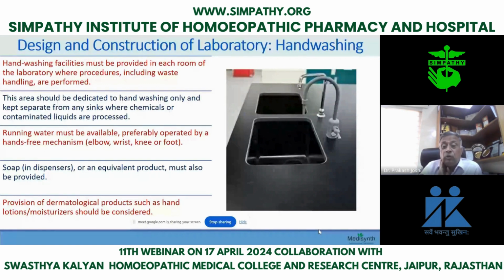Then, if you want to mix that for preparation of mother tinctures, every mother tincture is not 98, 97%. There are mother tinctures which are 60% alcohol, somewhere 85%. So in that case also, the water you use matters. You cannot use tap water. You need purified water.